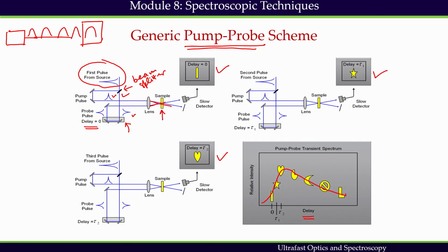The probe pulse can interrogate the time dependent and time induced changes by monitoring sample's absorption, reflection, refractive index, ionization, fluorescence, and so on. Temporal evolution observed by the probe pulse is schematically depicted with different shapes here for demonstration.